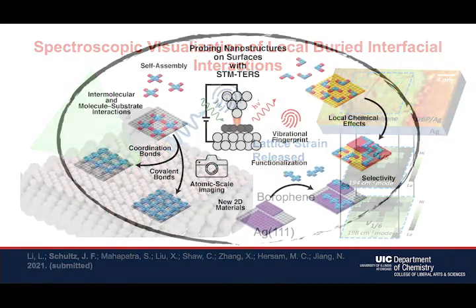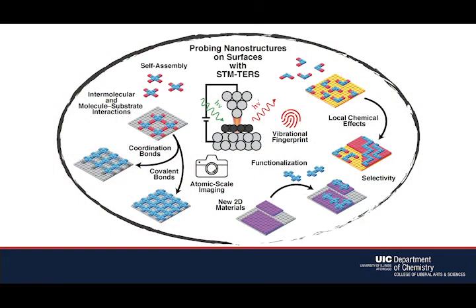spatial resolution. To conclude, the tandem technique of UHV STM TERS enables unique investigations into the fundamental interactions that govern surface-supported nanostructures. Simultaneous atomic scale imaging and vibrational fingerprint information at the sub-nanoscale enable the study of the effects of highly localized environments on the molecules, materials, and chemistry that can be used to fabricate nanostructures.